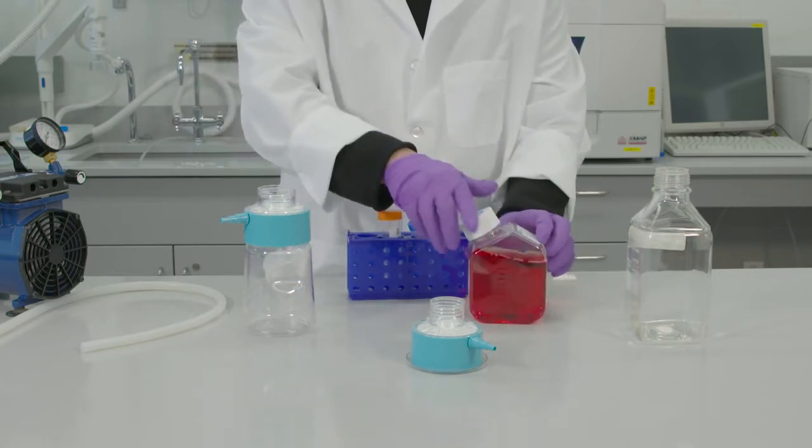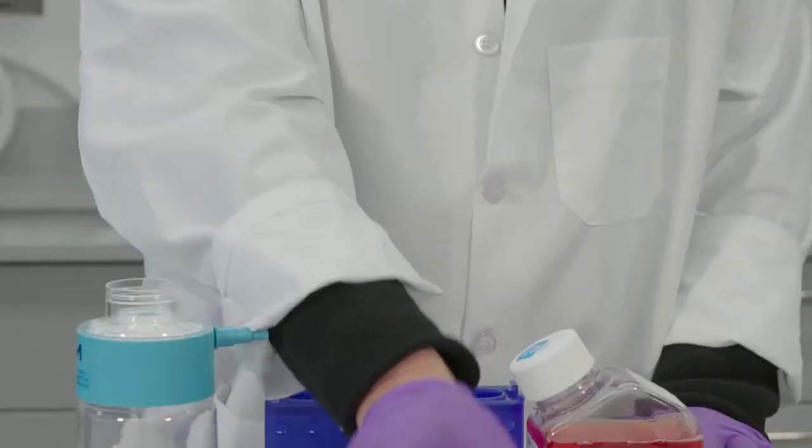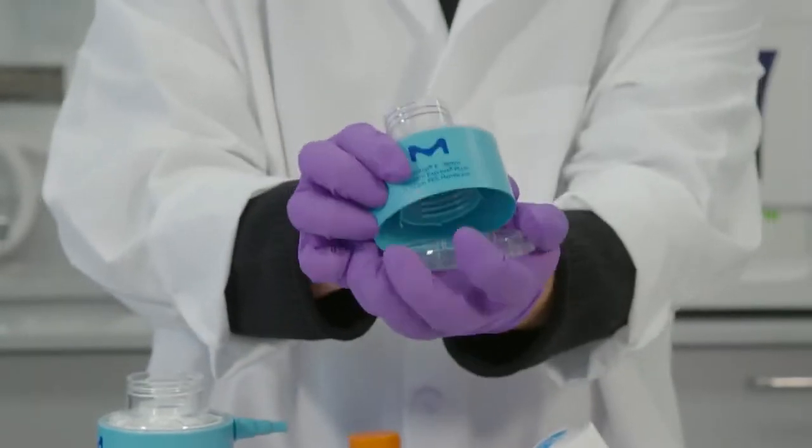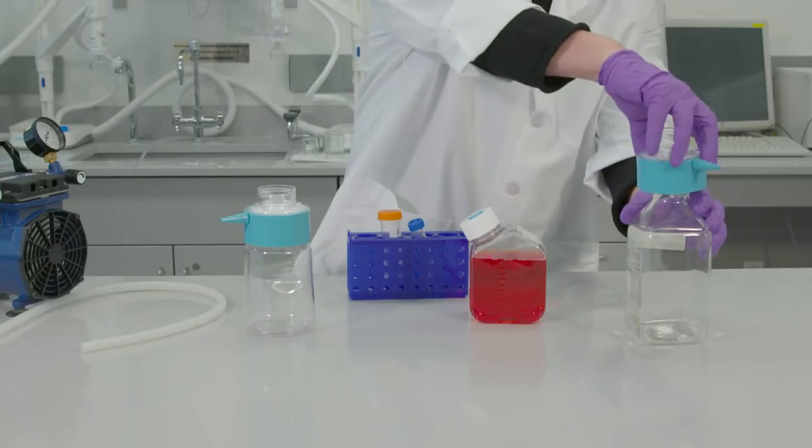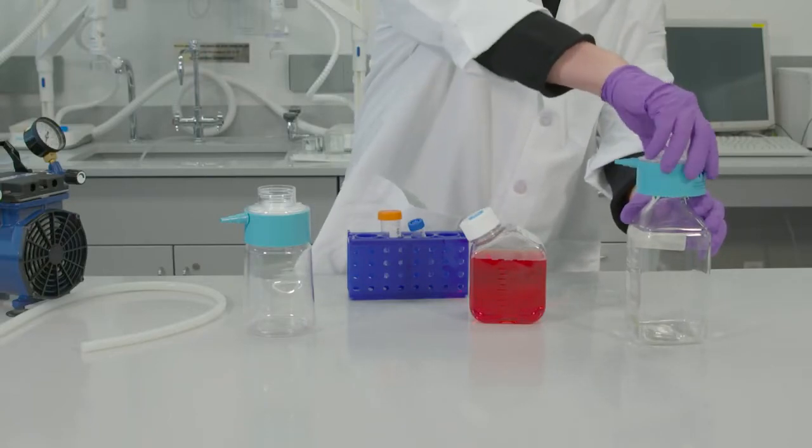If using the SteriTOP E device, remove lid from the base of the device, then screw the filter into the top of a glass bottle with a 45 millimeter neck size.